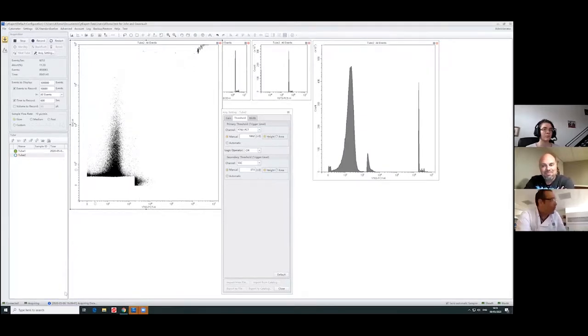Let me explain another thing here that I really like. I definitely want to see some noise, because I don't know where I need to stop. And sometimes the surprise is just a little bit above the noise. As you said, we have limits. We are playing at the limit of the detection. So sometimes there's some population pulling out just at the limit of the detection, so that's really good to see. Okay, so I'll go as low as I can, or as low as this little toy allows me to go.